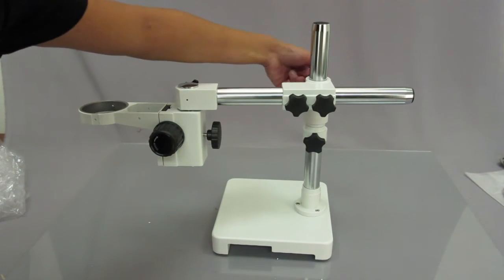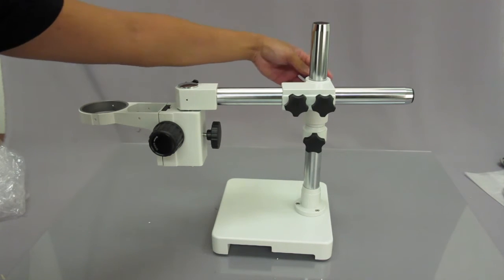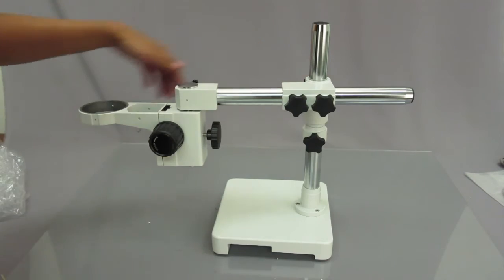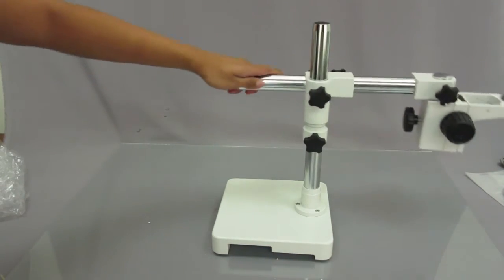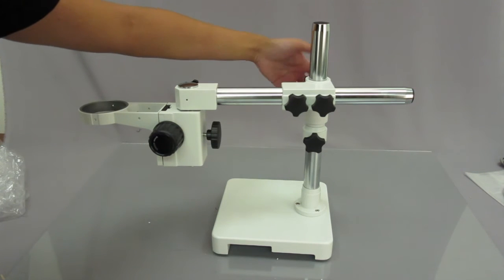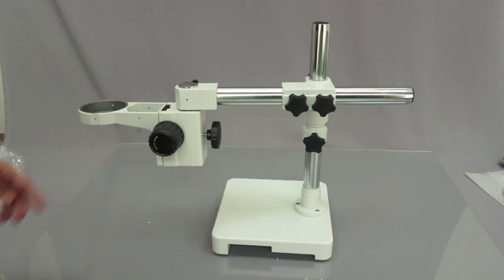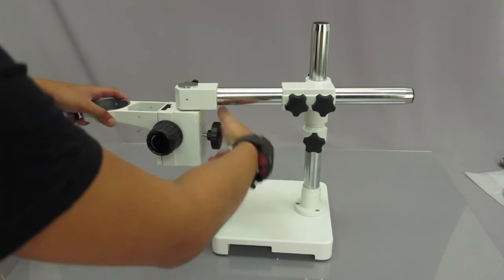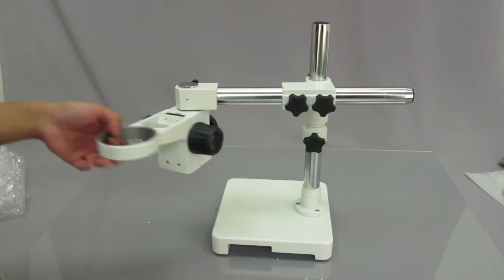Notice how with the stand I can rotate this a full 360 degrees. All you'd have to do is unscrew this knob in the back. And you could move it around as much as you want. Now if you want, you could also move the head. Just unscrew this part in the back. And you can move the head left and right.